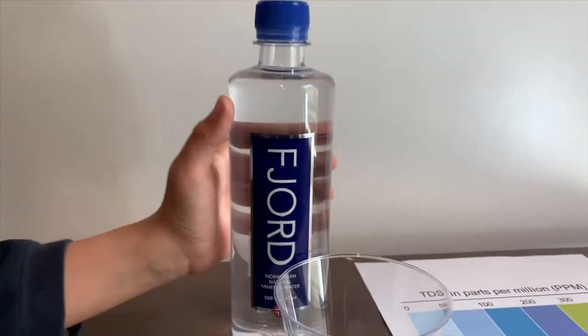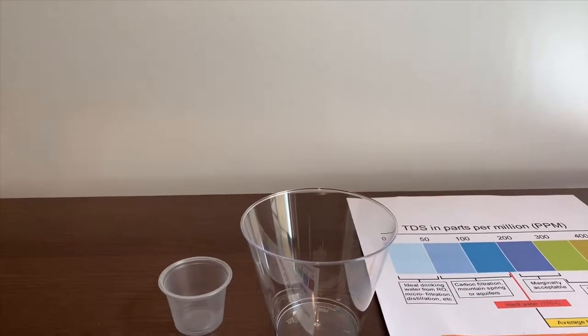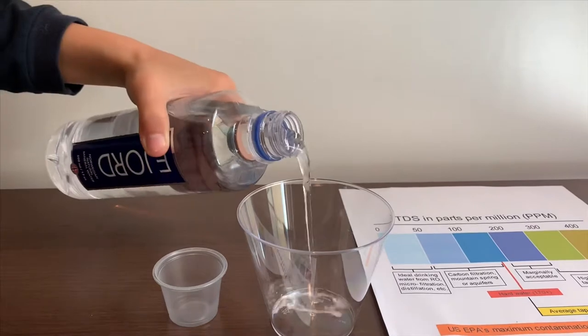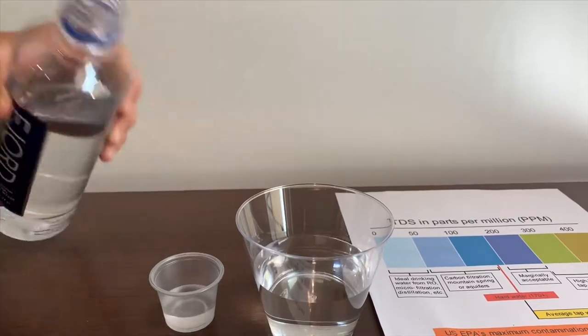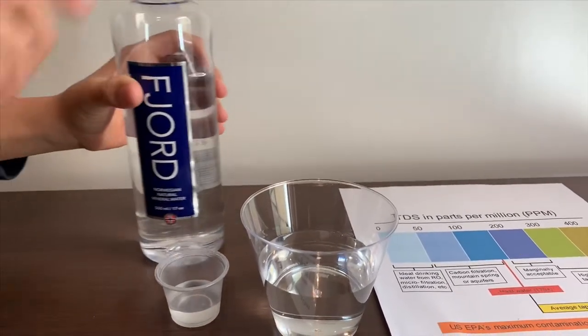Let's test the pH and the TDS. Let's pour some water in. First we're going to test the TDS now.